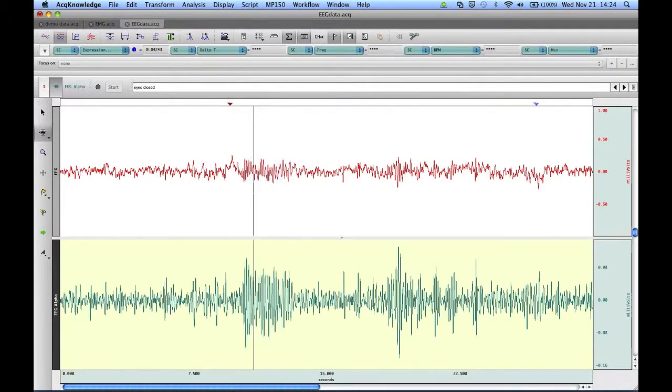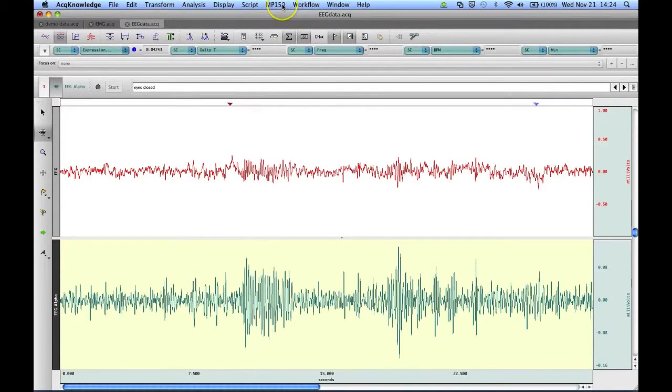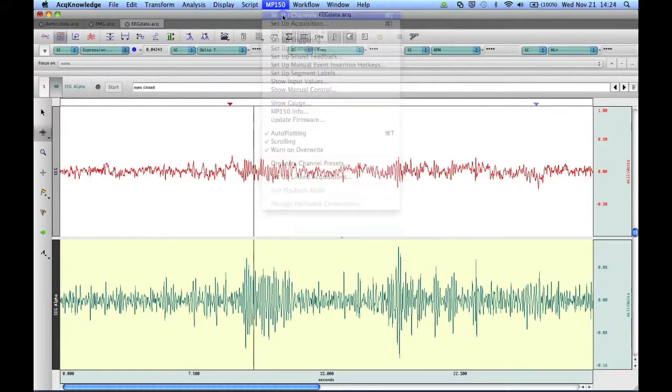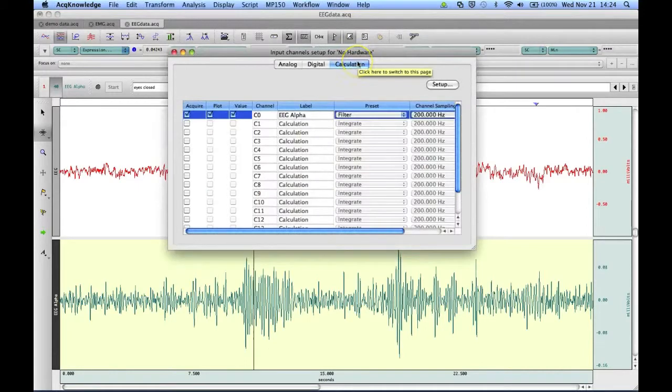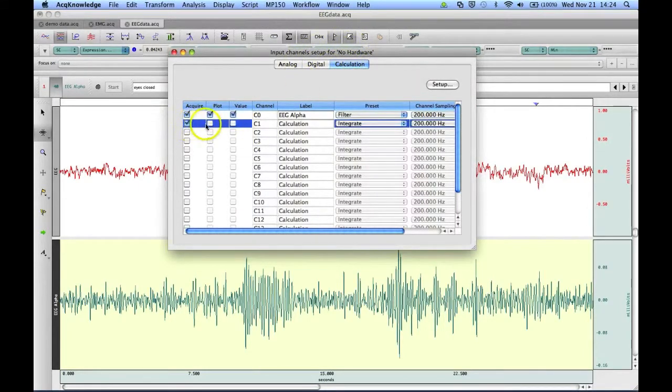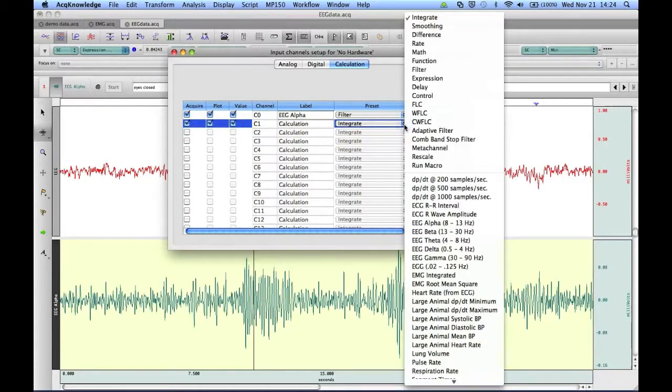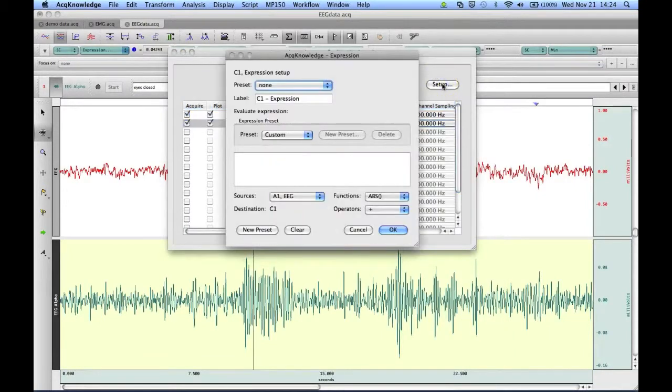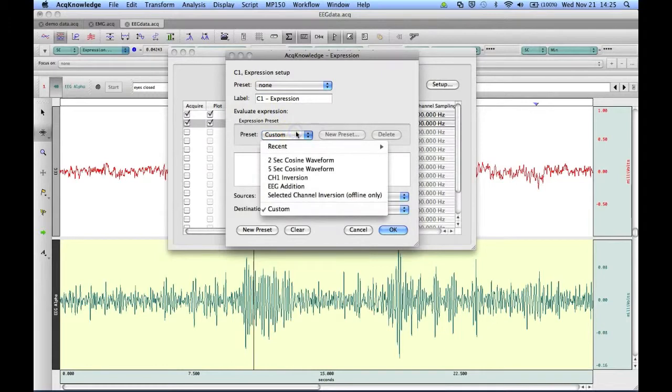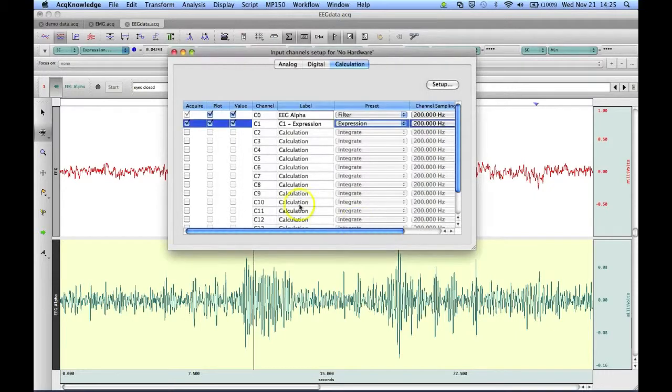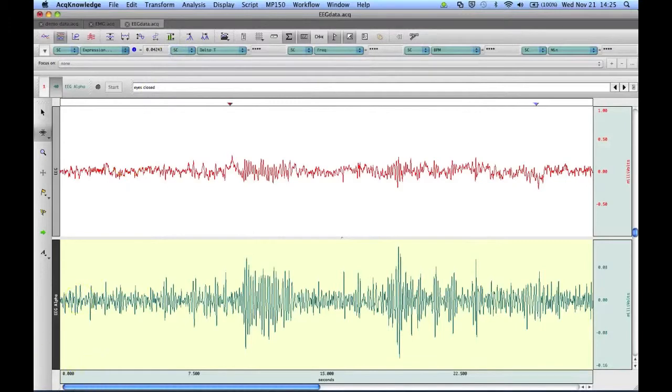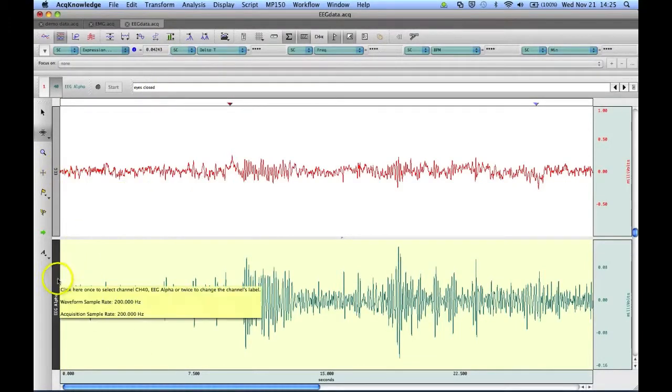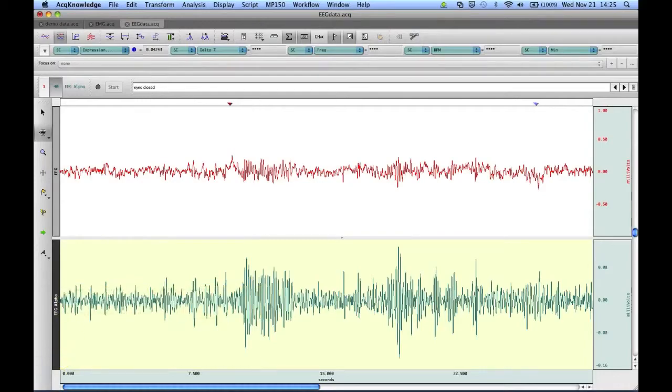One more place that we can use our Expression preset is as an online calculation channel. To do this, we go to the MP150 menu, select Setup Channels, and in the Calculation tab, we can turn on a calculation channel, go here to Expression, select Setup, and we can go here to our preset, and select EEG edition, and click on OK. And now if we were to start recording new data, we would have a third channel shown on our display that would be the sum of this channel plus this channel in real time.